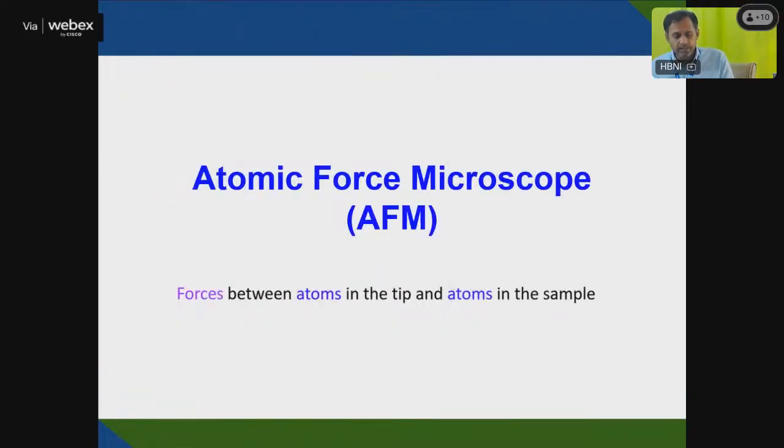So basically in TEM you will get imaging, where bright field and dark field are there. You can get image, shape, and size information as well as crystallography information by diffraction pattern. In addition, you will get information about defects, lattice planes, and dislocations by using HRTEM, or you can see the atomic arrangement by HRTEM. So I'll just take another 10 minutes to discuss atomic force microscopy.